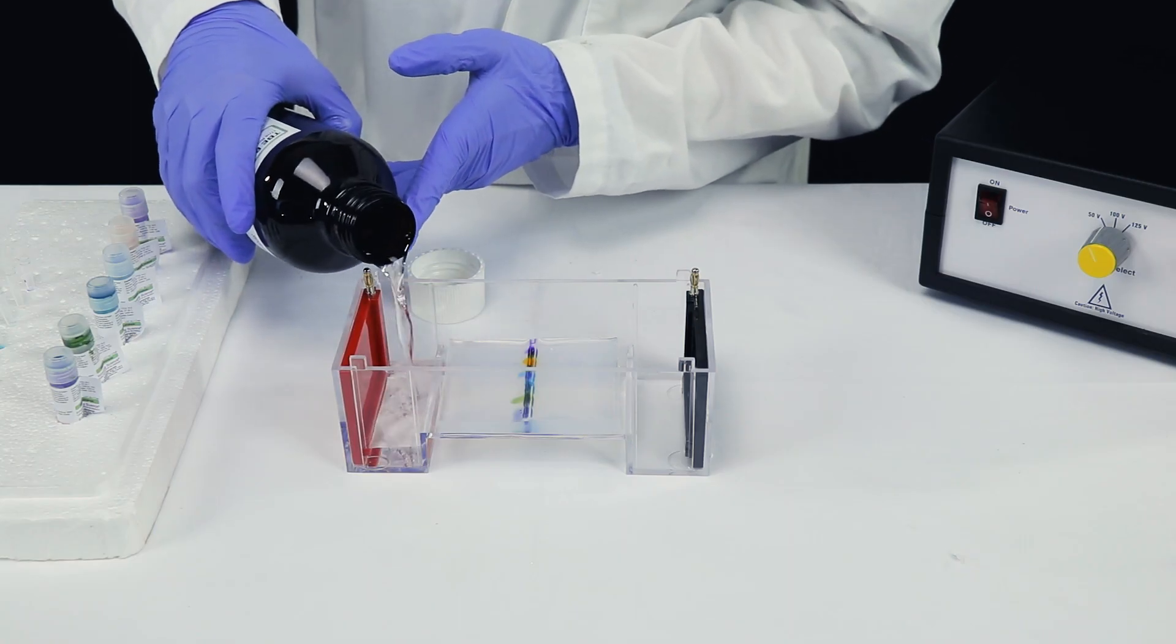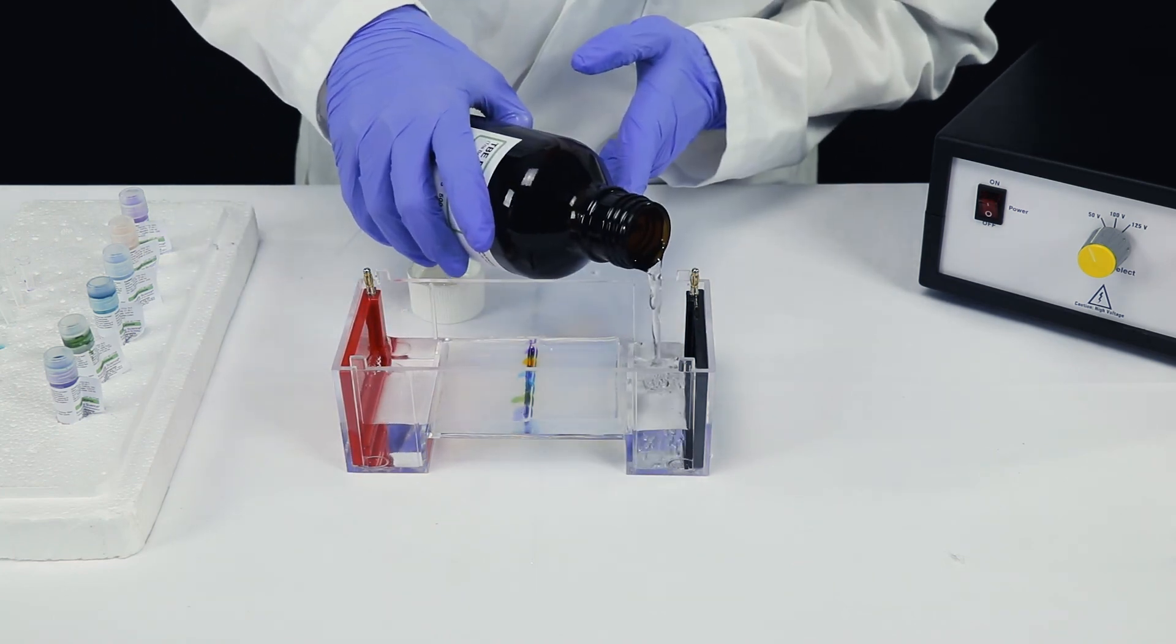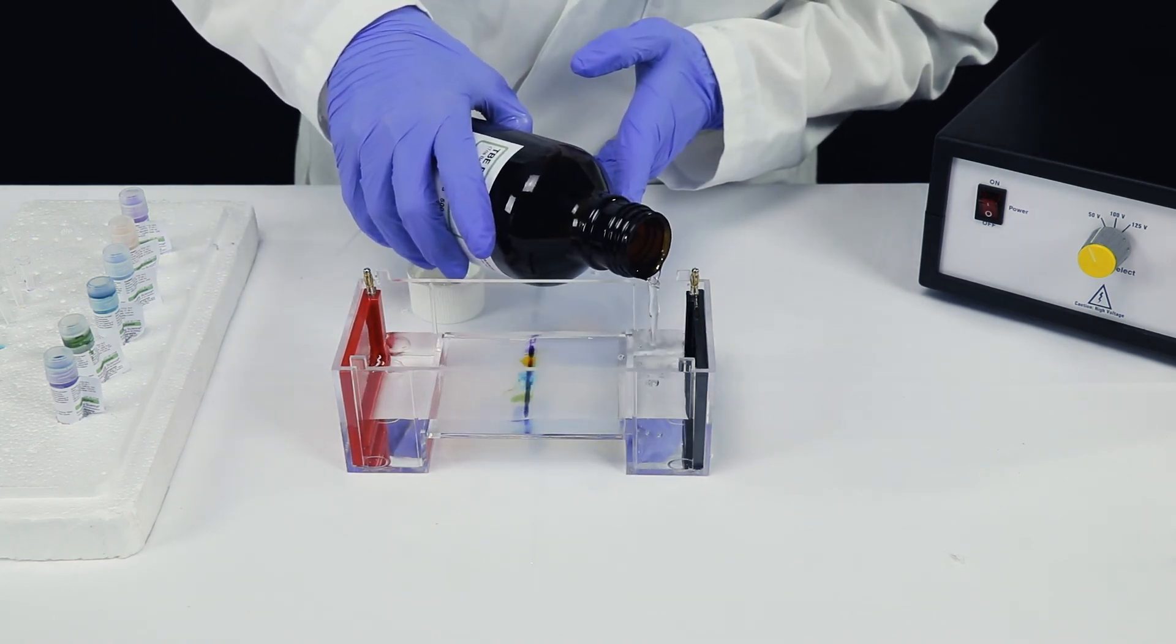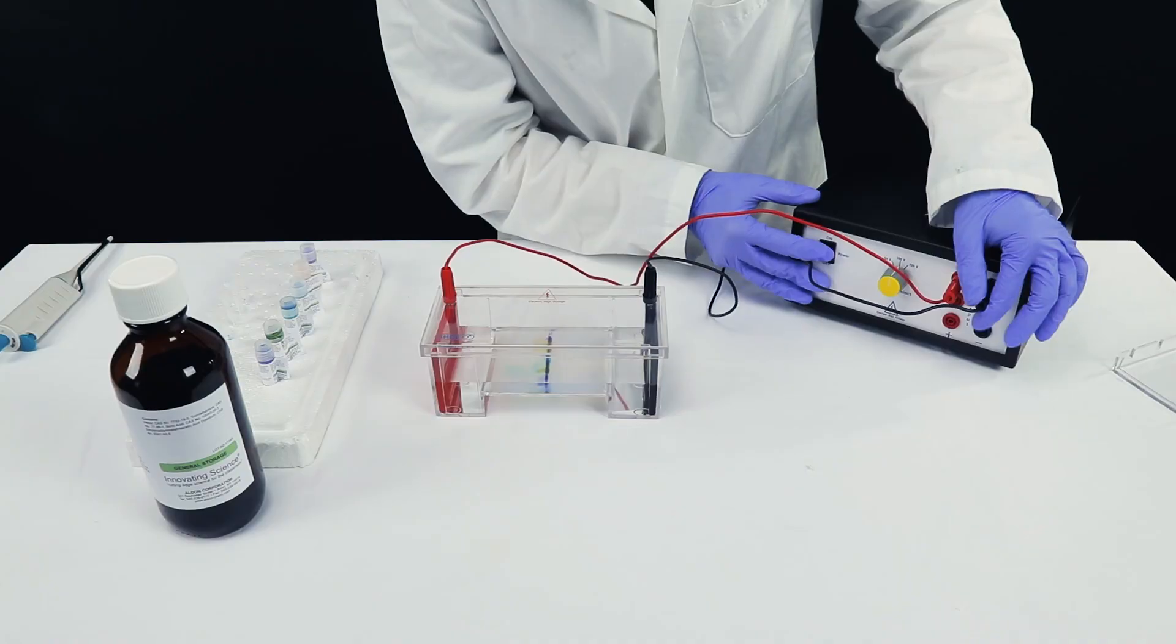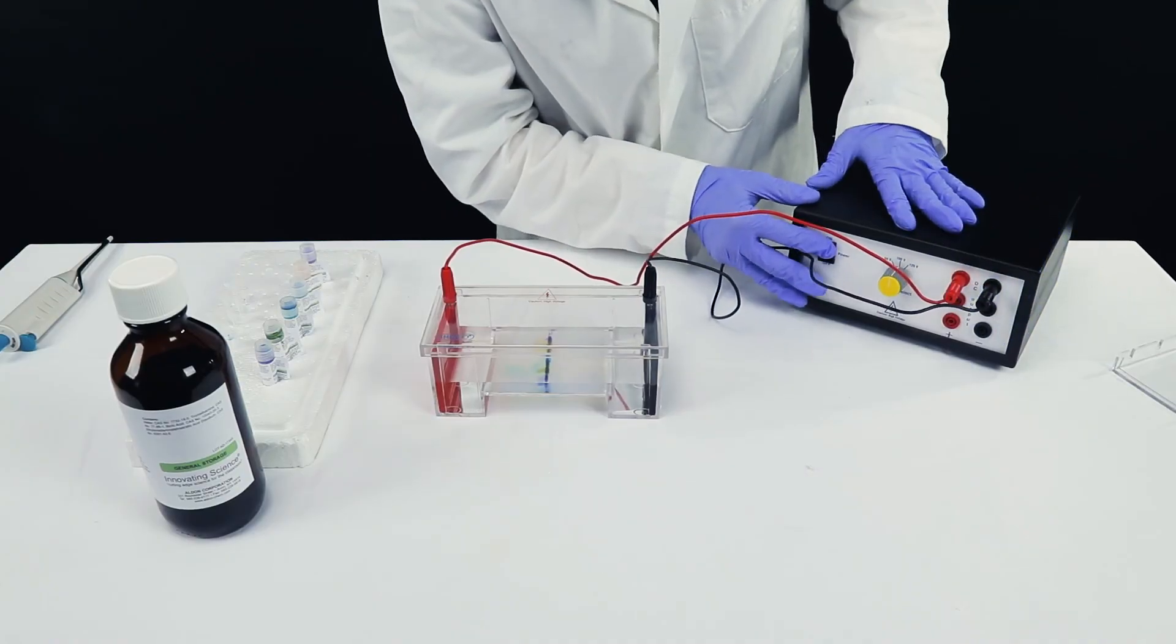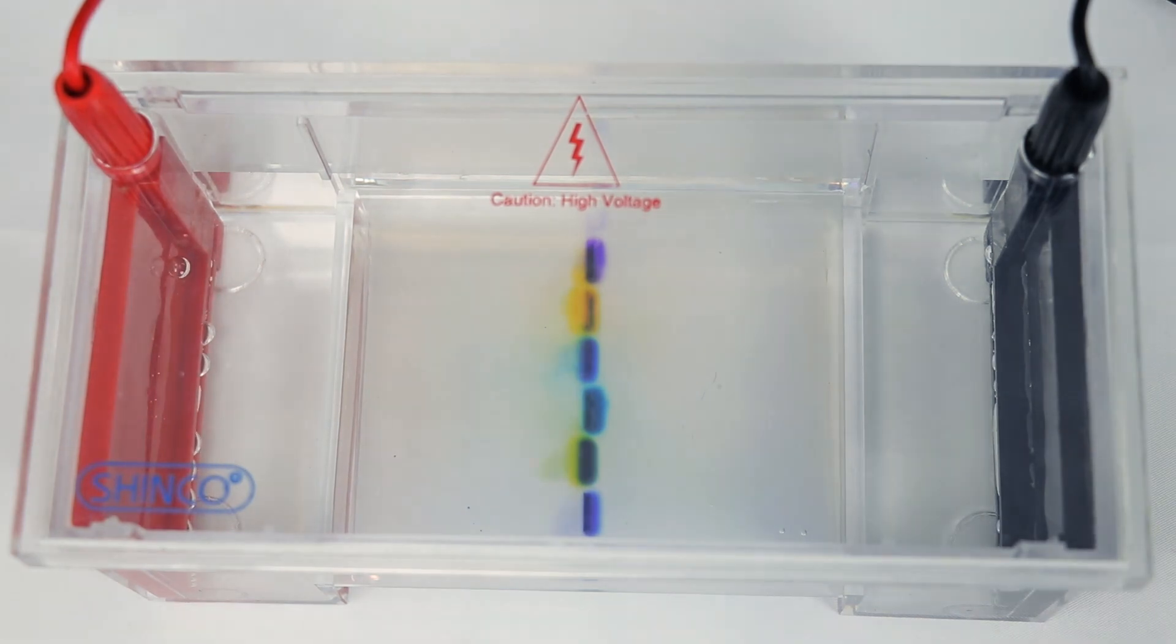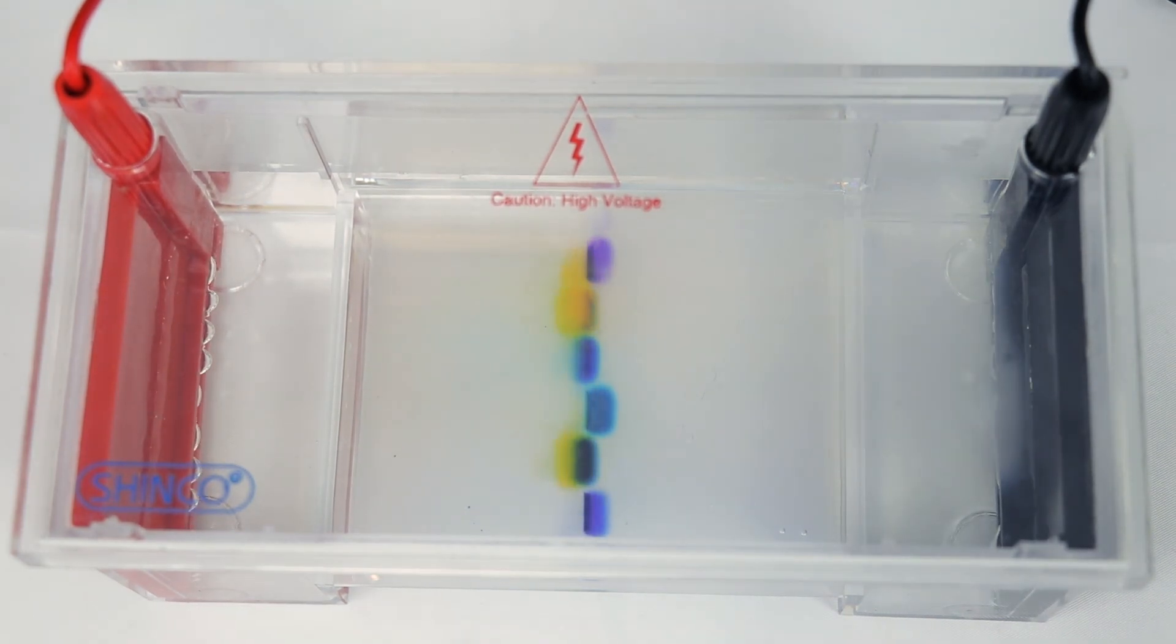Now, add the TAE buffer to the tank and fill just above the surface of the gel. After the wells are filled, close the cover on the tank and connect the electrodes to the power source. Although the separation doesn't happen quickly, you'll need to watch carefully so the dyes don't run off the ends of the gel.